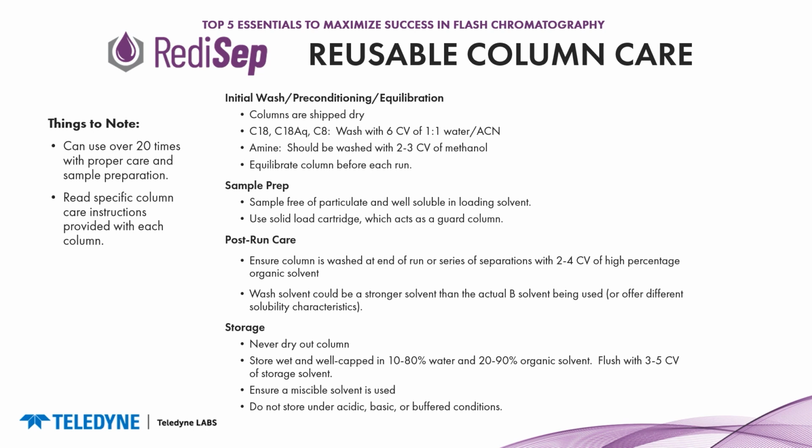Storage: never dry out your column. Once you're done using a column, make sure that you put those red caps back on. We always ship our columns with these red caps, one for the top and one for the bottom. So once you finish your run, make sure that those 2 caps are in place.